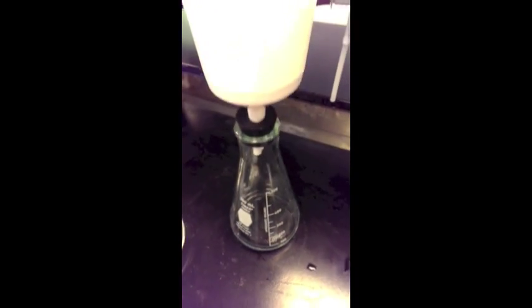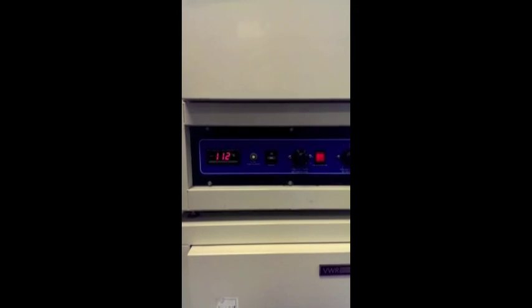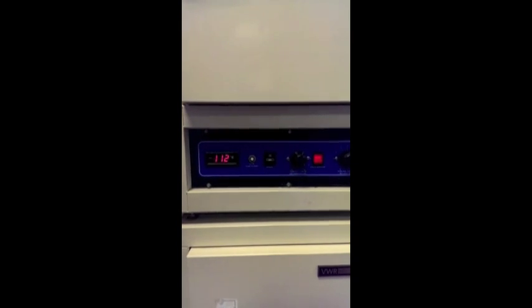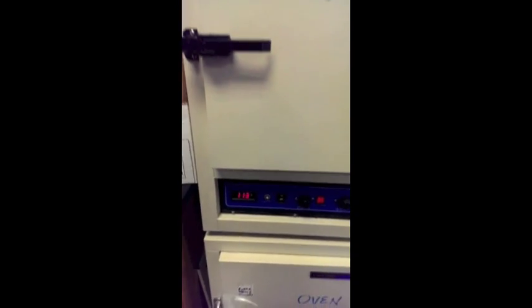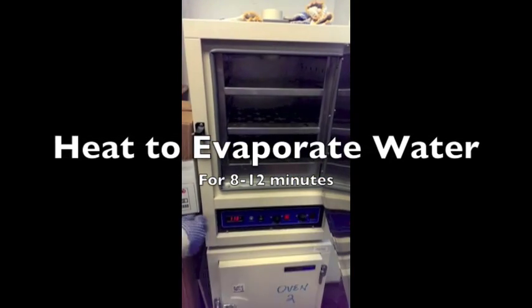This is what the filtered precipitate should look like. Use the spatula to carefully fold the filter paper and remove the filter paper onto a watch glass. Once the oven reaches a temperature of between 110 and 120 degrees Celsius, place the watch glass into the oven. With my bare hand? No, Jesse, with gloves.